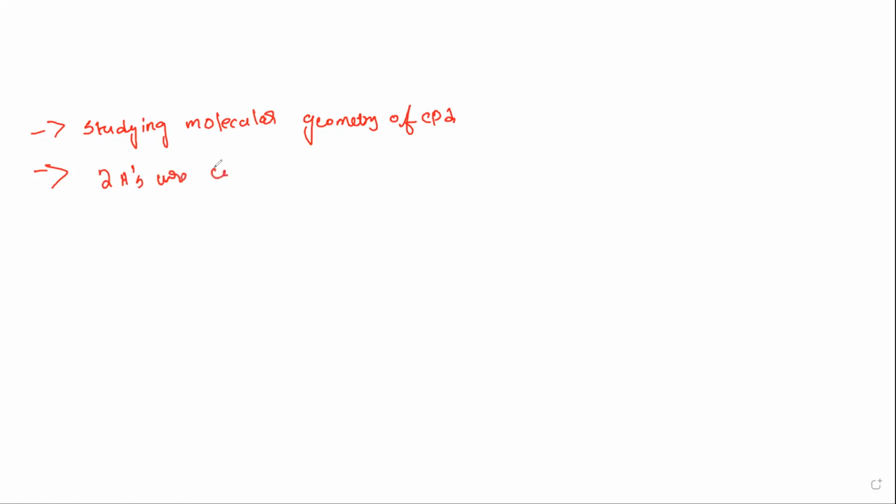This method is very useful in studying the molecular geometry of the compound. Also, it tells whether two protons are in close proximity within the molecule or not.